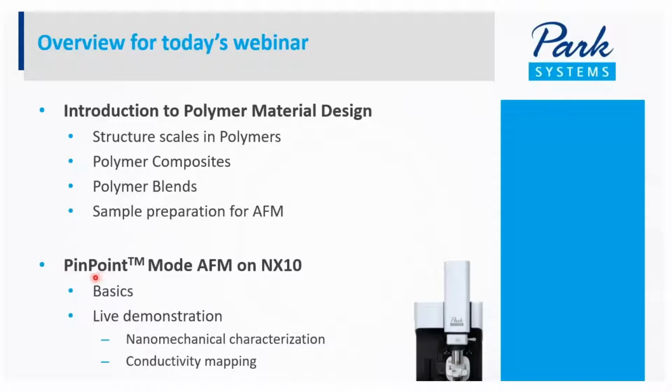In the second part, I will switch to the pinpoint mode of AFM on our NX10. This is a very nice picture of our NX10 system, which is our small sample research AFM tool. I will talk about some basics of pinpoint and then move to a live demonstration of the instrument and measurements. I will conduct nanomechanical characterization on a polymer sample and conductivity imaging using pinpoint.